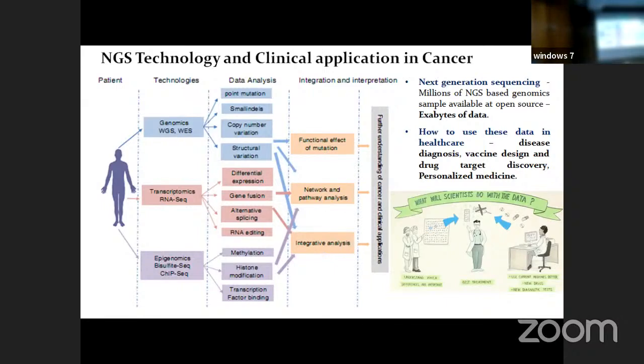Our hands-on session today will majorly focus on RNA applications. We'll be talking more about differential gene expression analysis. I would suggest all of you log in with a laptop, which will probably be provided, or if you have one. We'll take an example and perform differential gene expression analysis to identify potential drug targets from the RNA data. Of course, another thing is epigenomics, where you can study the methylome, histone modification, and transcription factor binding. All these things you can integrate for further understanding of cancer. So how to use this data in healthcare?